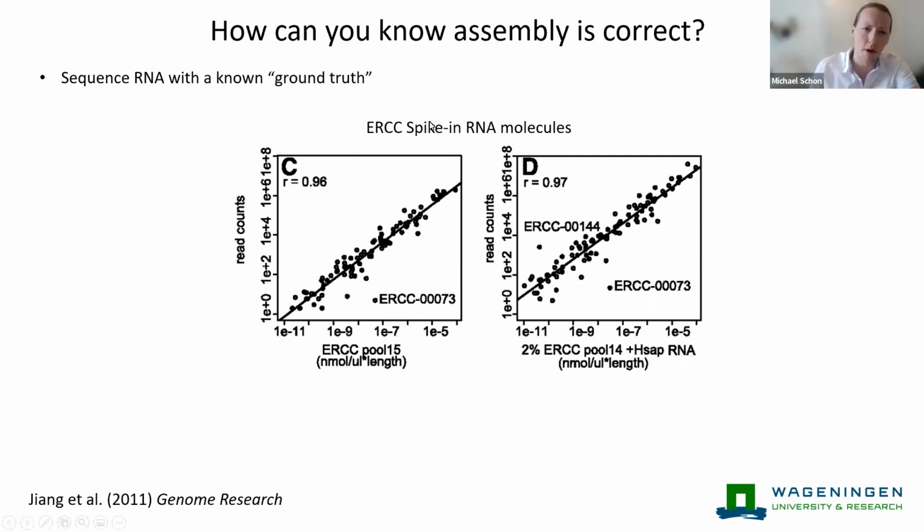This set of ERCC spike-ins that was published over a decade ago now has been incorporated into a lot of sequencing libraries, and it's a set of what was 96, now it's 92 distinct synthetic RNA molecules that can be spiked in a known concentration into your sample that you're sequencing, and you can understand essentially how quantitative your RNA sequencing method is, or your quantification method is.